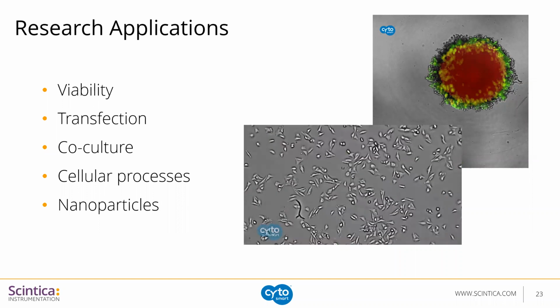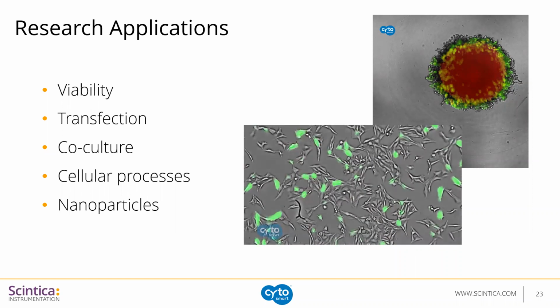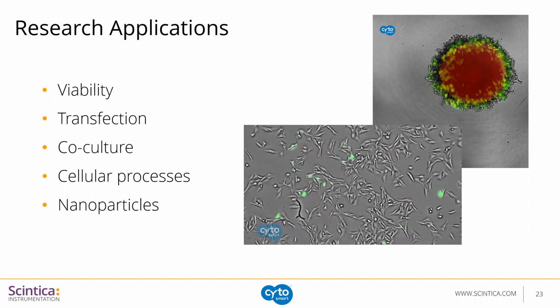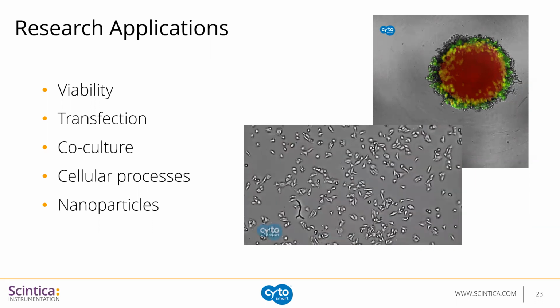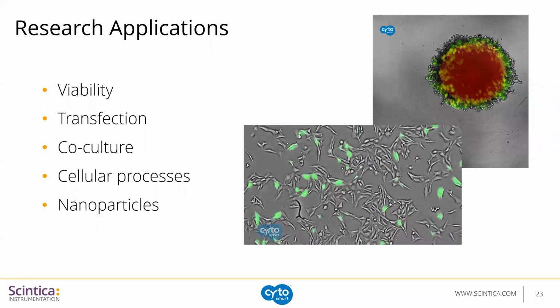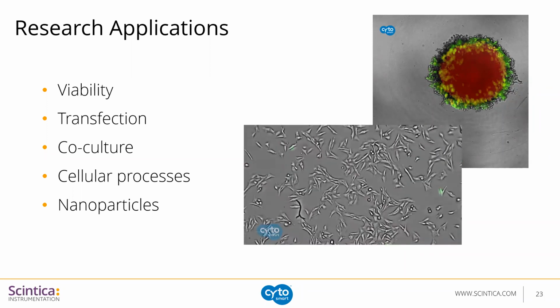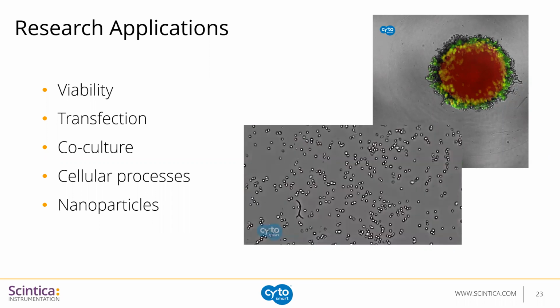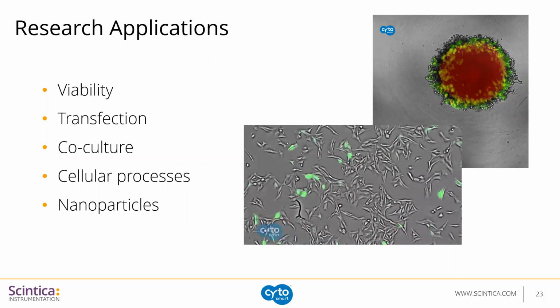Transfection is a popular application. So looking at the percentage of a population that's expressing your gene of interest a certain amount of time following transfection or transduction. And that can be important, especially if you're looking at viral transduction in perhaps a BSL-3 lab where you don't want to remove the viral counterparts until a certain amount of time. You can actually have the microscope keeping track of all this and getting your transfection efficiency data.